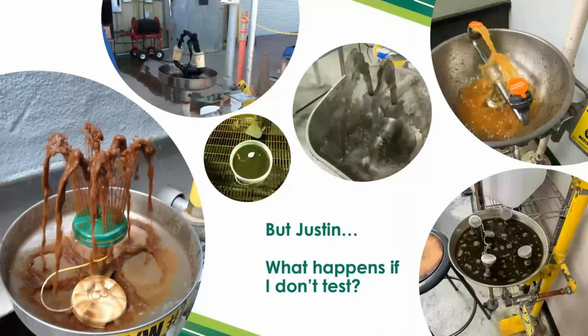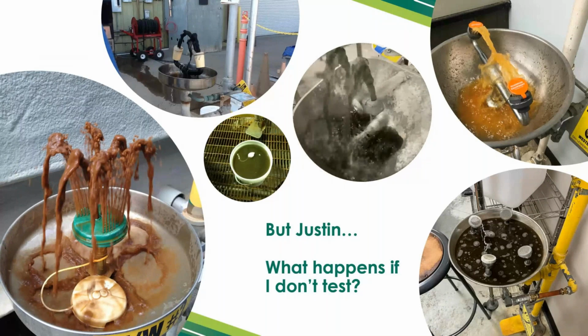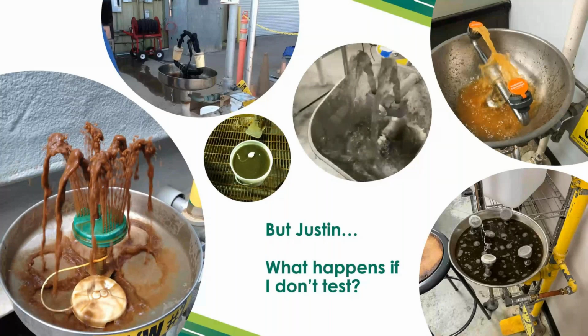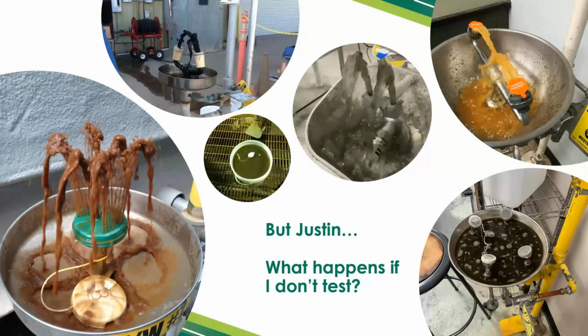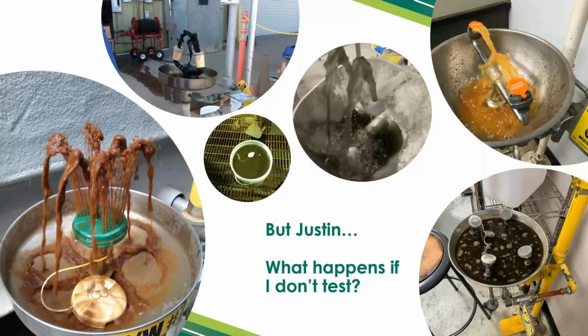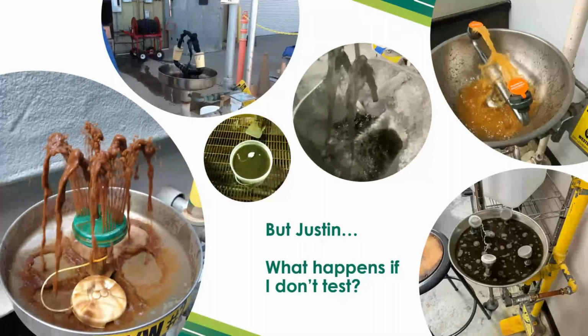Gatorade, coffee, gray water. I don't know. Freaks me out. It looks like the stuff Gandalf was drinking in Harry Potter. Super gross. And this is why we're emptying out that pipe on a regular basis. We want to empty it out, clear out the bacteria, clear out the sediment. Wait until you get a normal, clear water coming out of the heads of the device, and then move on.